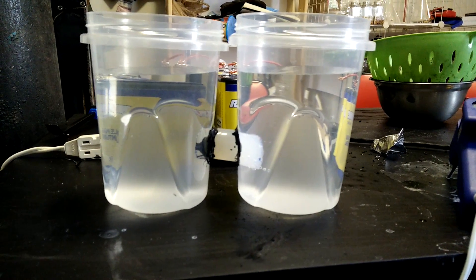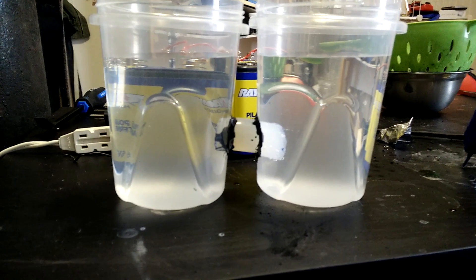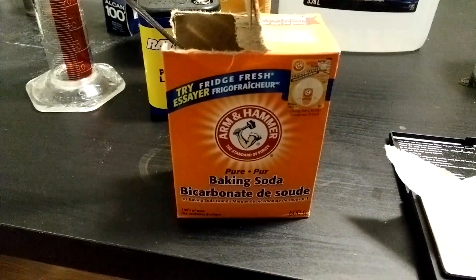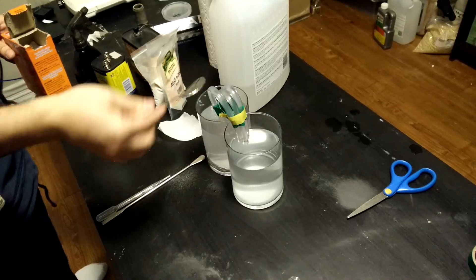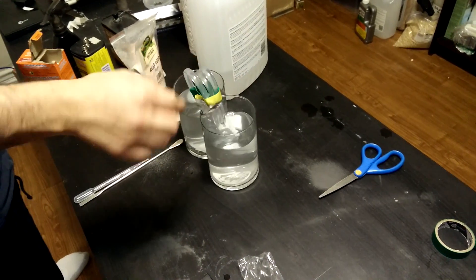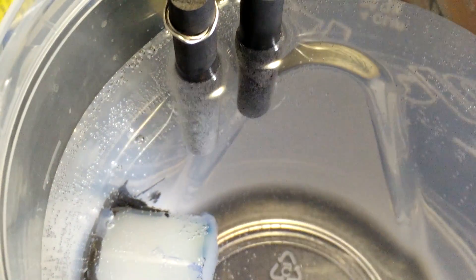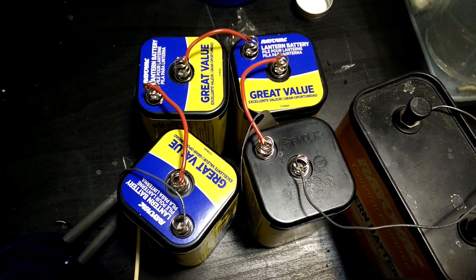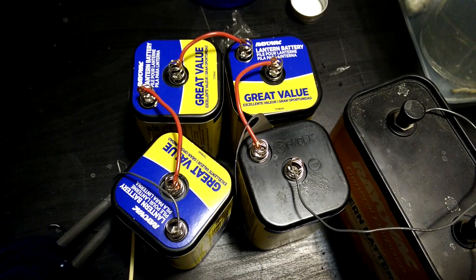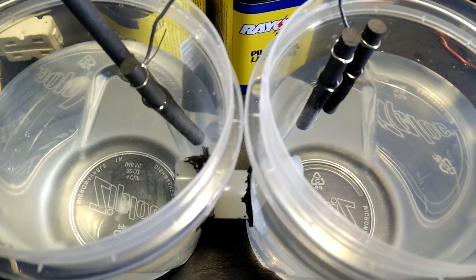Now that the gel is in place begin filling both sides of the cell alternating between each so as not to put too much pressure on the gel and make it pop out. Be sure to use distilled water. Once you're about halfway you can remove the tape. In the left chamber add a scoop or two of baking soda and stir it until completely dissolved. Ideally put a small amount of sodium hydroxide in the right chamber to make it more conductive, but this doesn't really matter. To power the cell use several batteries wired in series - I used four smaller lantern batteries and one larger one. Connect the electrodes with the positive in the baking soda side and the negative in the distilled water side.